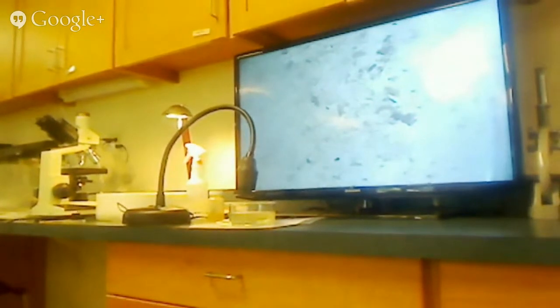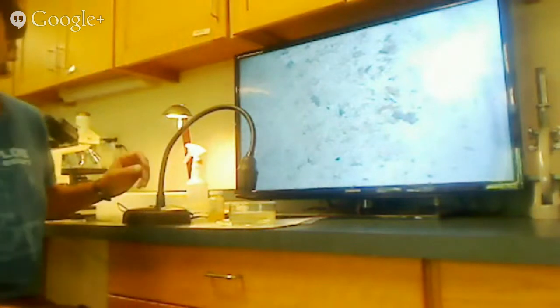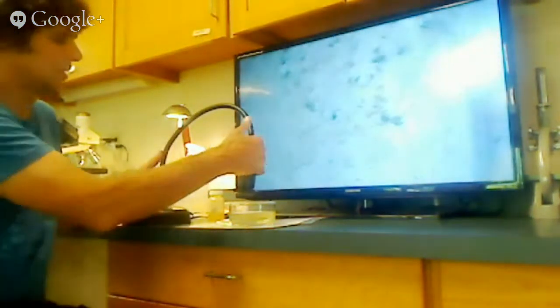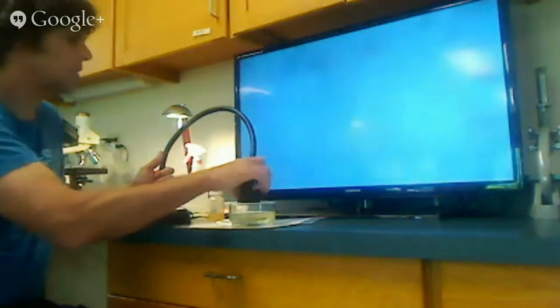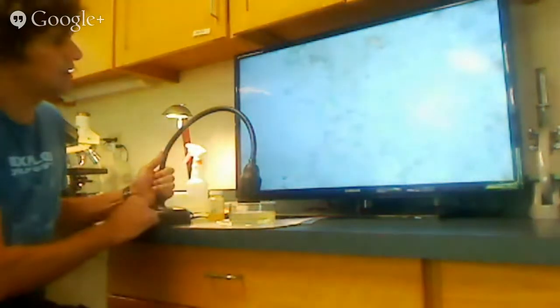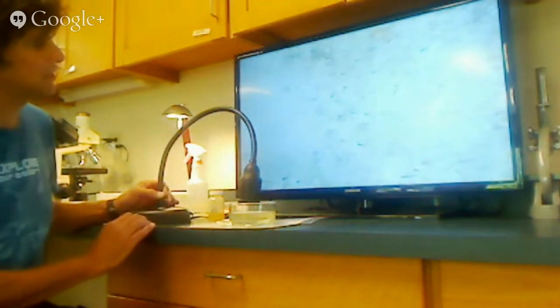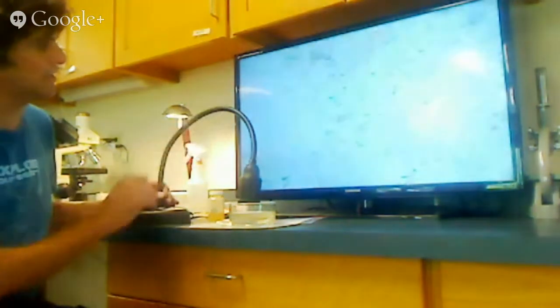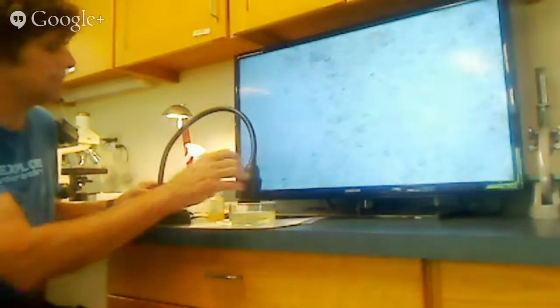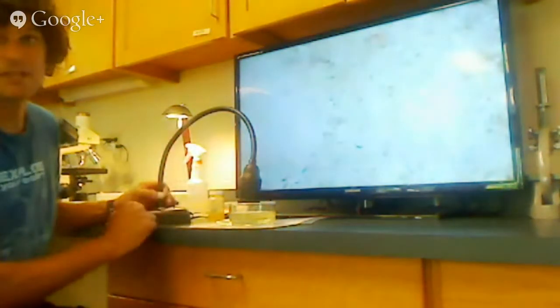Something like that. And these microorganisms, as we look down into this soup, we start to realize it's teeming with not just things that are large enough that we can sort of see them swimming around there. They look like little bugs, really. But it's also got some other filaments and things, and these filaments are actually the microscopic plants, the diatoms.